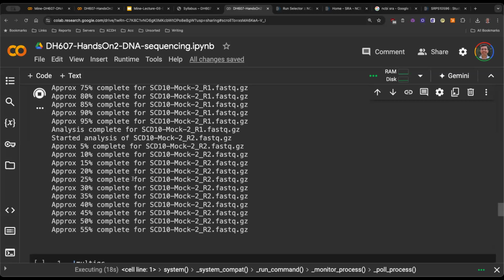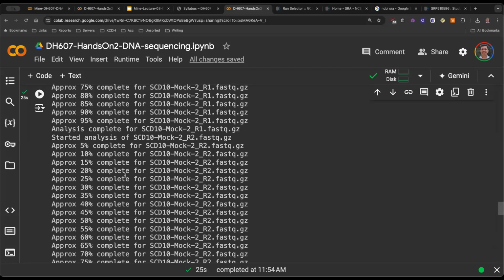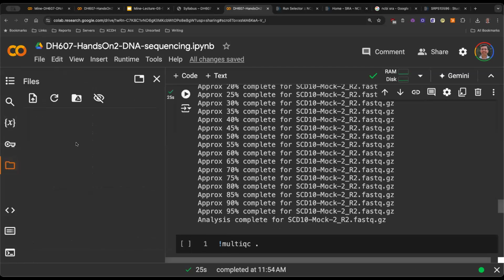So one project idea, you can see how slow this is, right? One project idea would be: how do you make a tool like this much, much faster? It's slow, and if you go and see the code, you'll figure out why. It was written like 15 years ago, and there'll be no updates. If you are able to create a clone of this tool for analyzing this, that'll be wonderful.